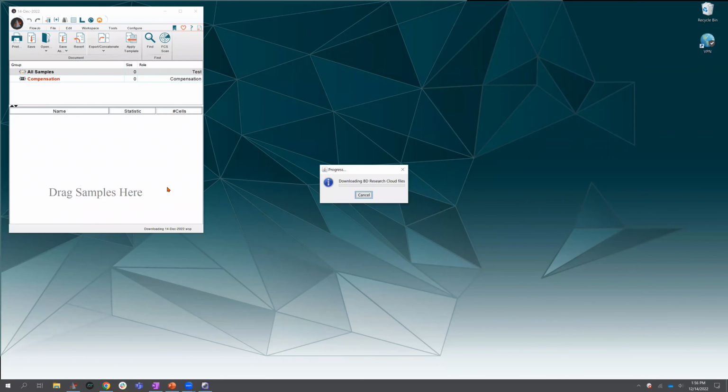Depending how large the file is, it might take a minute or 2 to open, but you shouldn't have any lagging during the analysis. It might just take a second to open the first time. And so you'll see it'll open and it'll retain that FCS file, so I don't have to reconnect FCS files, and that same analysis will still be there as well. Okay.